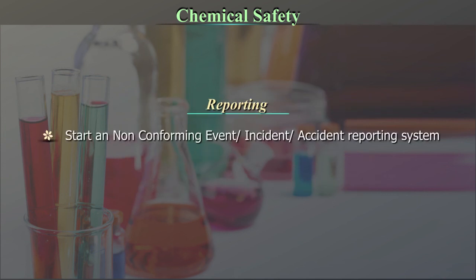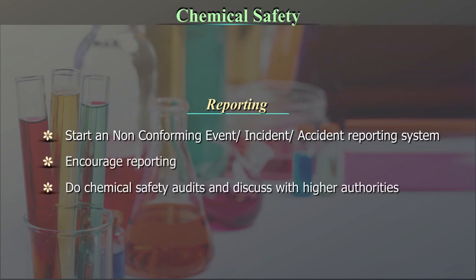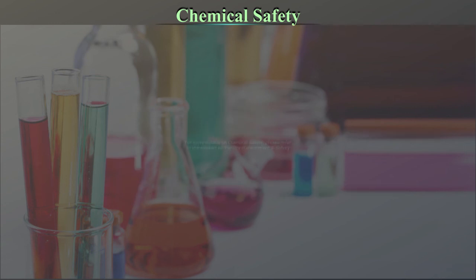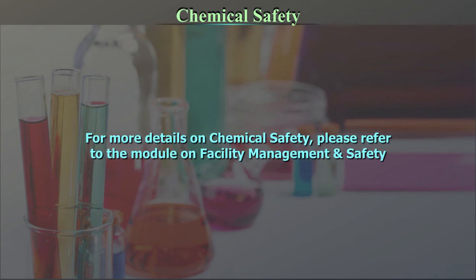Reporting: start a non-conforming event incident/accident reporting system. Encourage reporting. Do chemical safety audits and discuss with higher authorities. For more details on chemical safety, please refer to the module on facility management and safety.